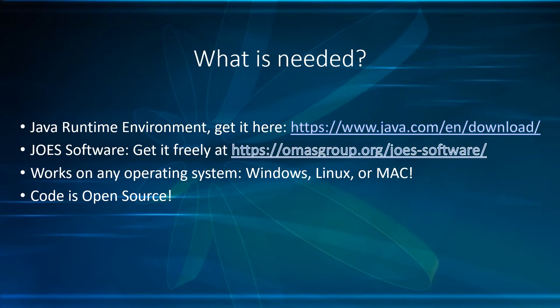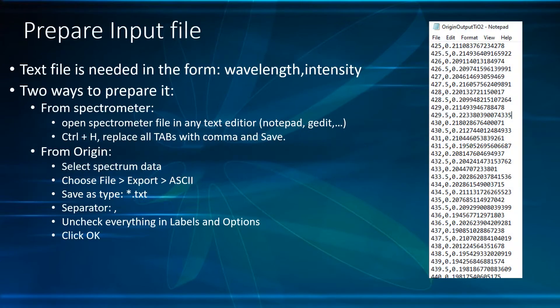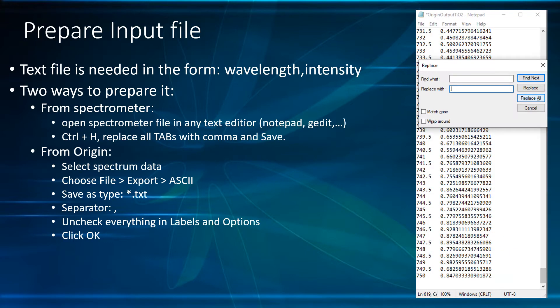How to prepare the input file? The input file must be in the form wavelength versus intensity, separated by comma. There are two ways to prepare the file. Directly from the spectrometer, open the file in any editor and replace all the tabs with commas and save.